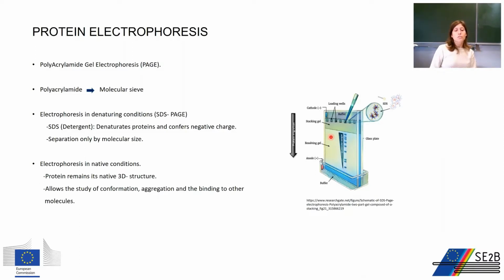In this kind of electrophoresis, the protein will remain in its native 3D structure. This allows the study of conformation, aggregation, and the binding to other molecules.